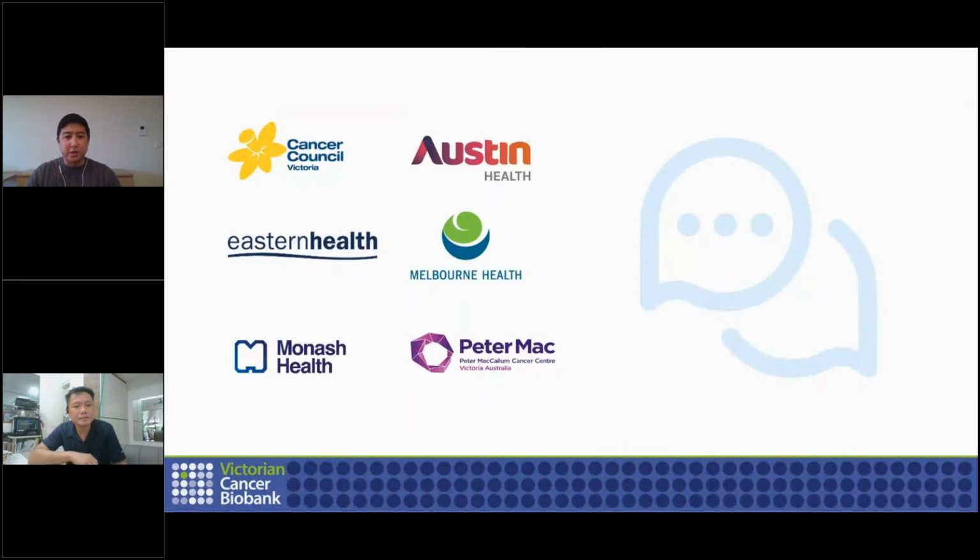Sure. Thanks. I guess I'll answer your second question. We capture identifiable information within our database. When it gets released to the researchers, our VCB team, specifically our project manager, provides de-identified data and doesn't provide patient identifiers like the name and date of birth, just the clinical data itself. We do have 5 sites, and sometimes a donor can be registered at multiple sites. Because we use patient identifiers, OpenSpecimen allows us, if you enter the same name and date of birth, I think it is, Shri, to merge the patients together, so that's the same patient across 2 different sites. In terms of your first question, what was your first question again?